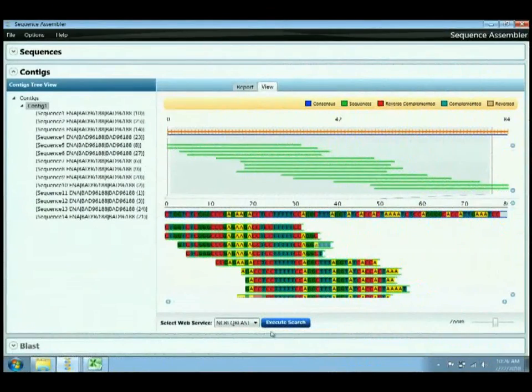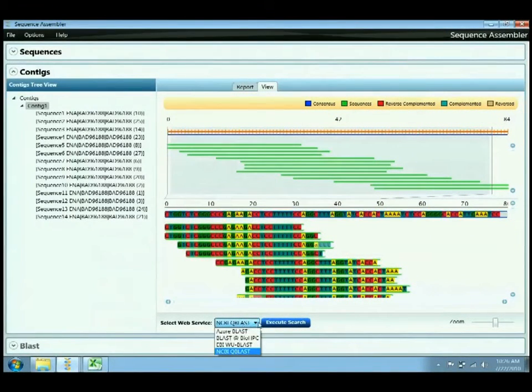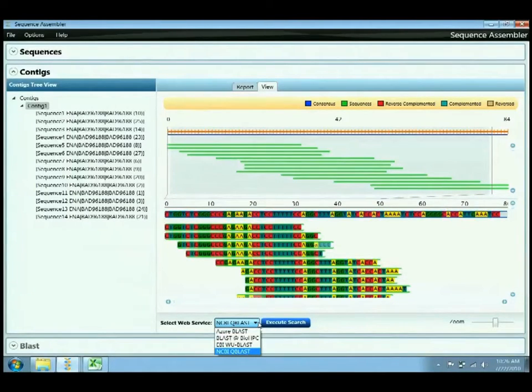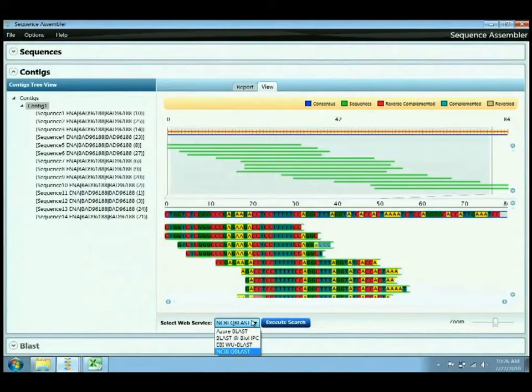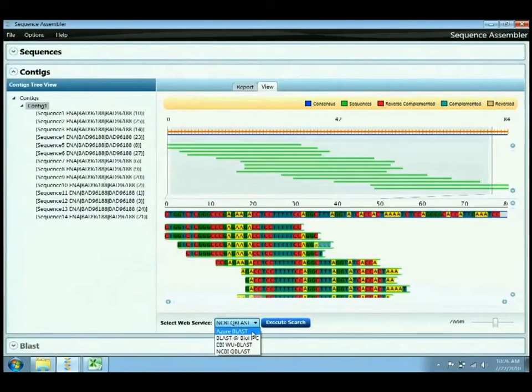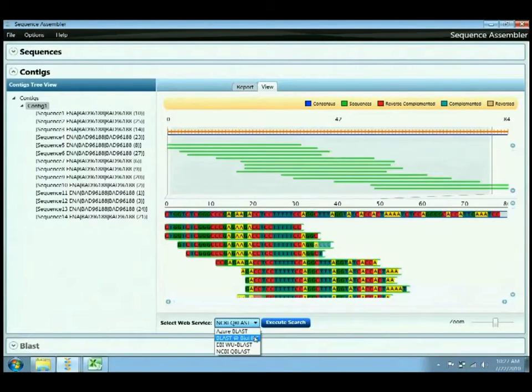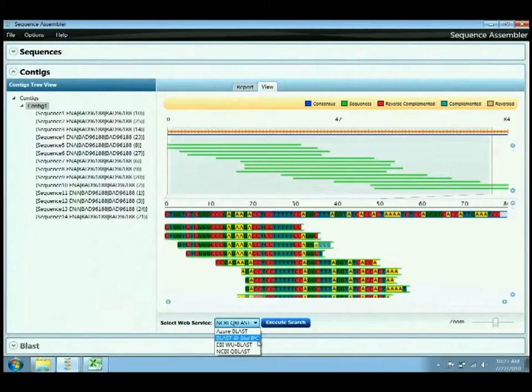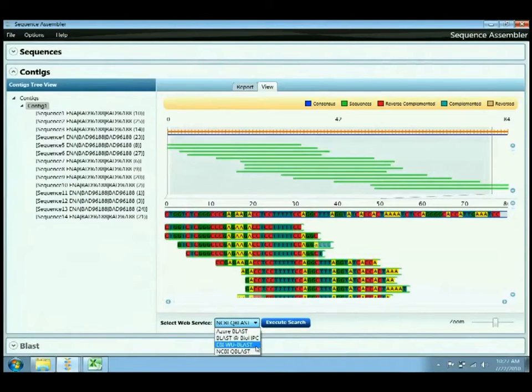The next capability provided in the sequence assembler is the ability to blast a sequence. There's various web service connectors available in the Microsoft Biology Foundation, which are all exposed here in the sequence assembler, including Azure BLAST, which is a sample demonstration capability of the Microsoft Azure cloud service using BLAST, as well as a service offered by Cornell University in their BioHPC lab, and the normal EBI and NCBI versions of BLAST that are publicly available and supported by various organizational and tax dollars.